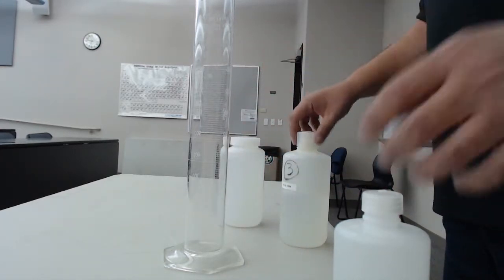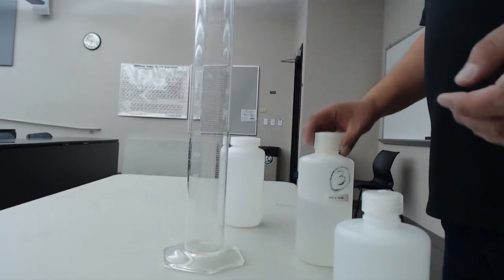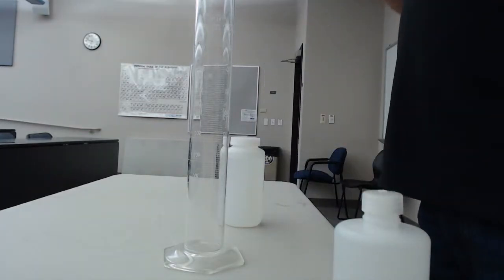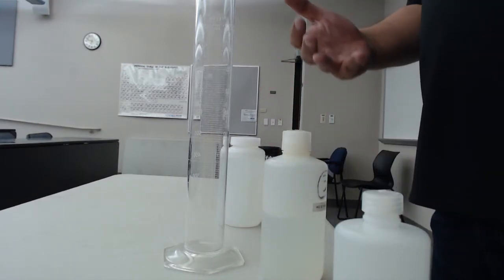The thing is, the reality of chemistry is that we actually can't see the chemicals a lot of the time. Just picking these bottles up, if it didn't have a label on it, I would have no idea which bottle was HCl, which bottle was carbonate. We have to have some way to see this.